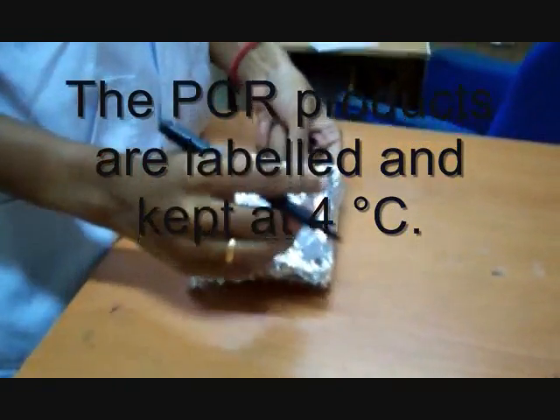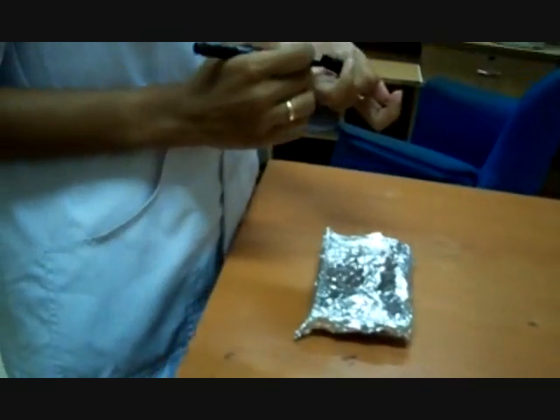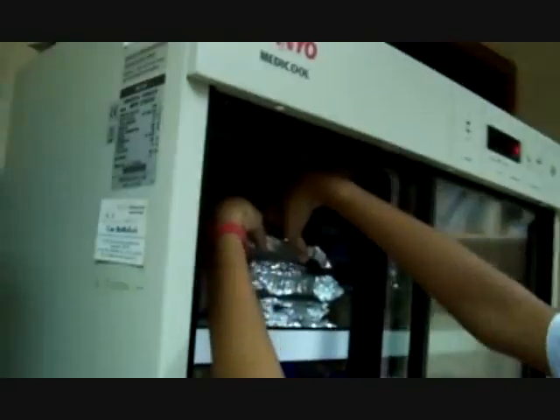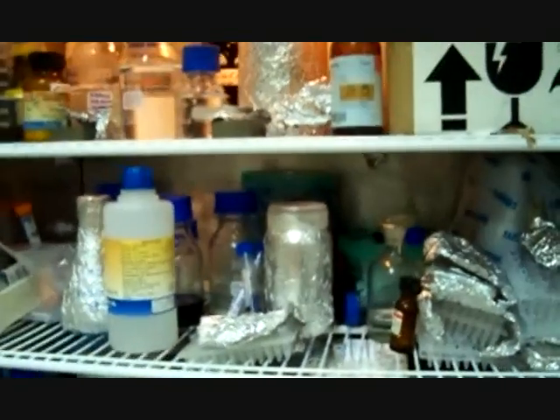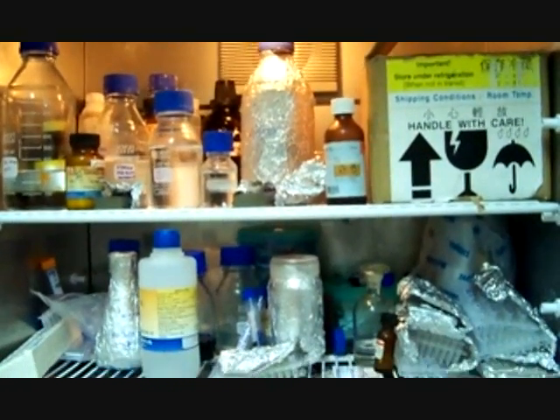The PCR products are labeled and kept at 4 degrees Celsius. Samples usually stored at 4 degrees Celsius include glycerol stocks, culture plates, buffers, PCR products, stock solutions, DNA samples, and antibiotics.